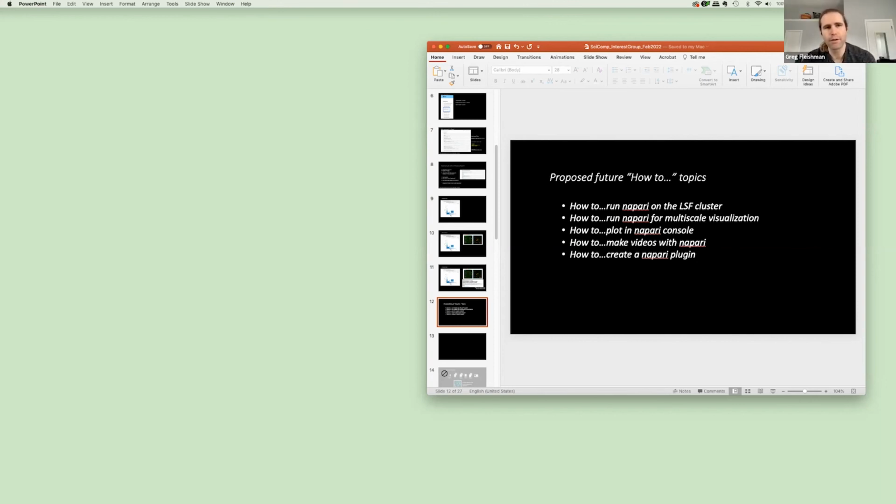Another potential solution would be to have your primary workspace be a Jupyter notebook where you can do visualizations in Napari and manual editing in another Python-based tool like what you built in PyQtGraph, and just make sure that they can handshake data with each other. So if you make an edit in PyQtGraph, you'd rerun a single Python function that reloads the data quickly in Napari, and maybe now you have multi-layer visualization and arbitrary slicing and things like that. Maybe the solution isn't forcing Napari to do the thing you want, but just getting it to communicate with the thing that already does what you want.